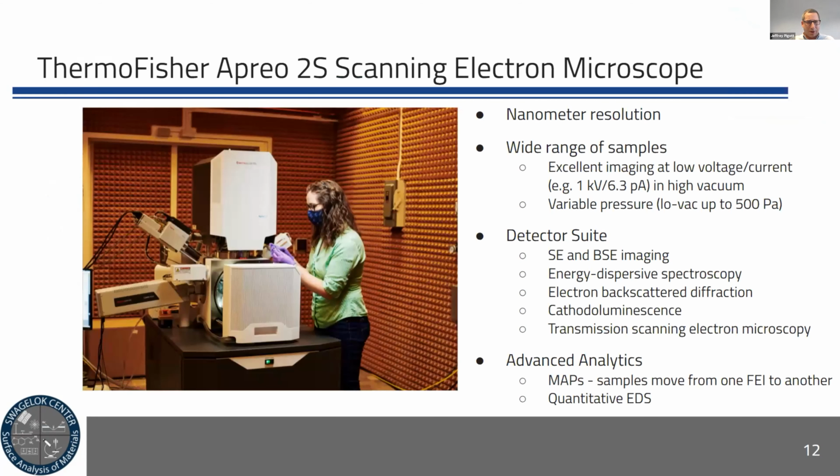So I'm going to talk about our new Thermo Fisher Apreo that was installed in March and April of this year and officially signed off on in May. Since the beginning of June, we've been training users on it, almost entirely student users, ranging from undergraduate to PhD, and also postdocs as well.